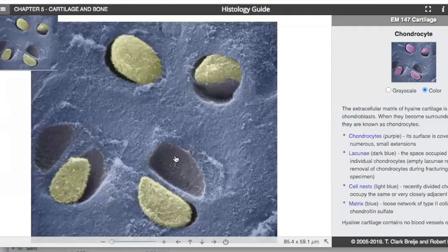Chondrocyte, lacuna, right? That's what they're sitting in right there. And you can see, especially with the hyaline cartilage, a lot of them are kind of closely linked. You'll see a bigger space with a couple of them in there, but each cell has its own little lacuna.